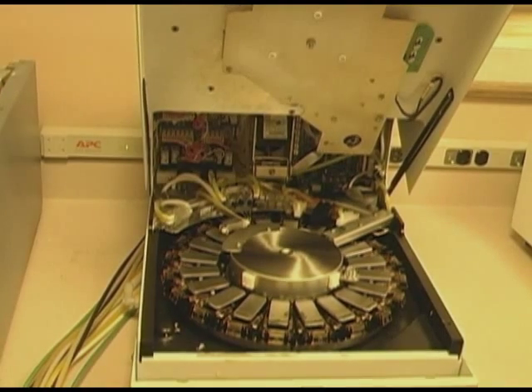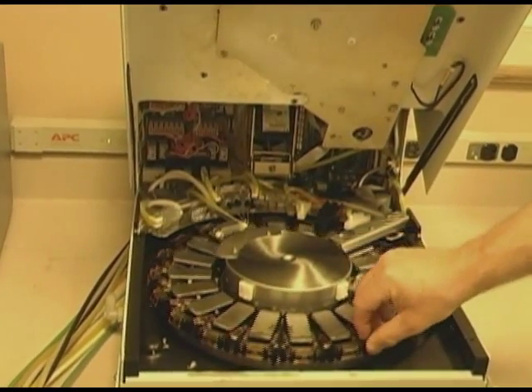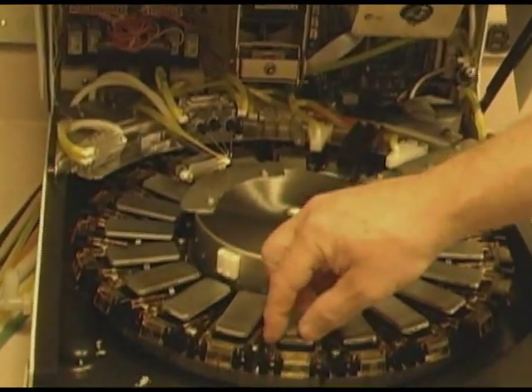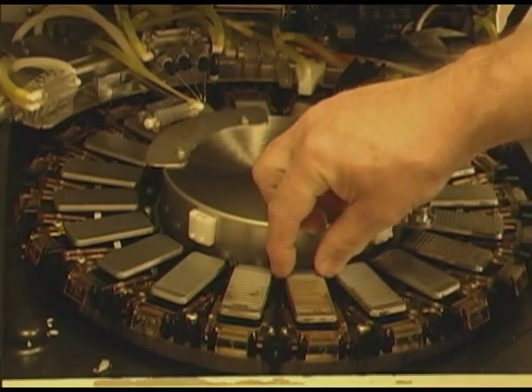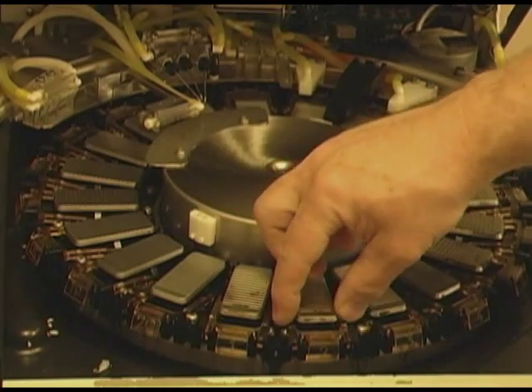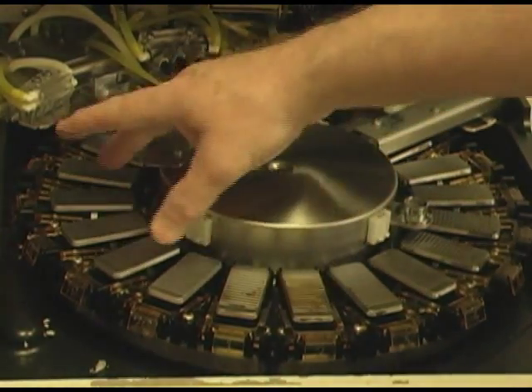Underneath here is the major working components of the system. You've got this bottom carousel, which is where the slides go. Each one of these are numbered and the slide goes across here. These are heaters — each heater is independent. When it comes to electronics, they do them in groups of four.